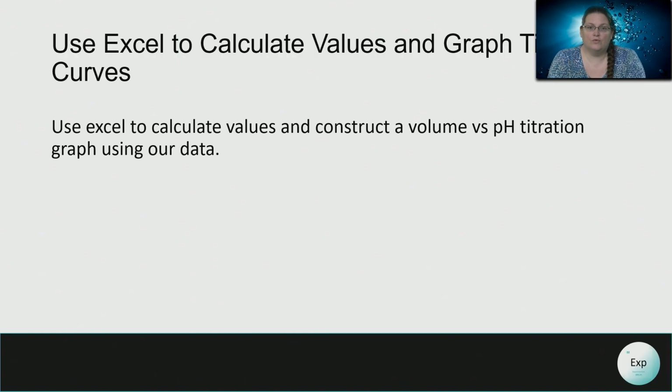We're going to switch over to Excel. You should be able to have access to this Excel document in the course modules so that you can pull that data sheet up, and then while you're collecting the data during the experiment, you can go ahead and plug in your values and your observations. And then it's one less step that you would have to take later, because then you can just quickly plug in the formulas by watching this video to know what your values are so that your data can then be submitted into your data table.